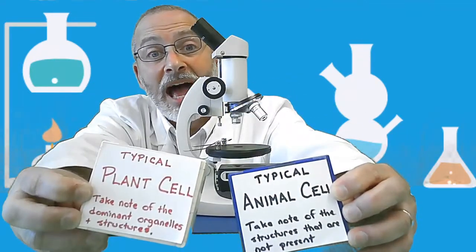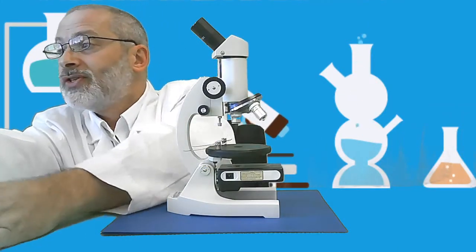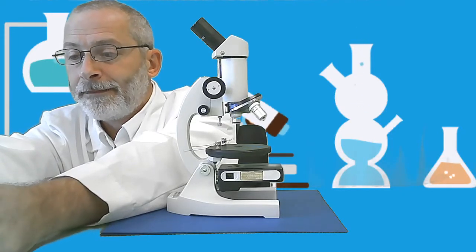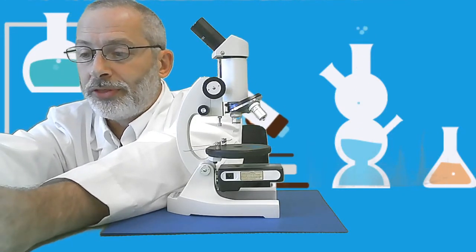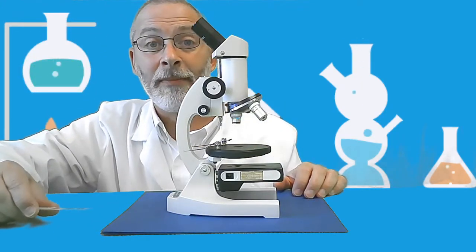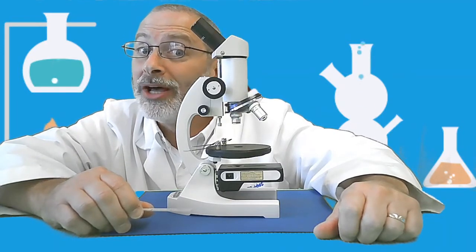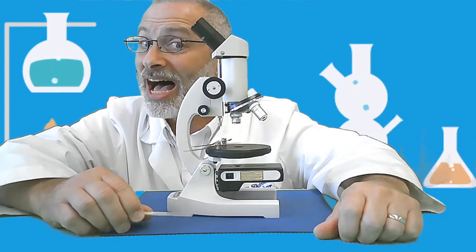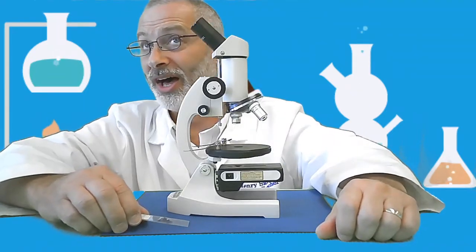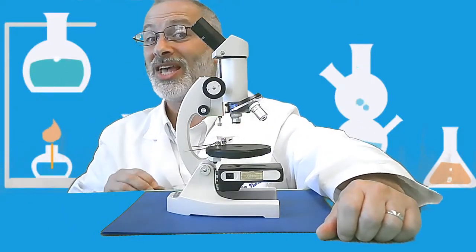Before we get to the actual lab, however, or your observations of it, I should say, let me put these off to the side so you can't see which one I'm taking. I just want to go over with you how to place the slide on the microscope. Anybody remember how we should obtain a slide? We should get the slide by the side and hold it by your side.